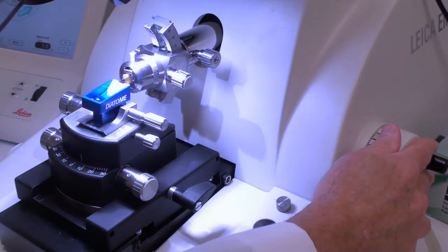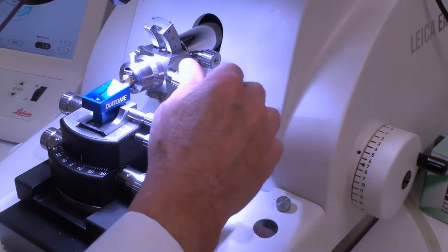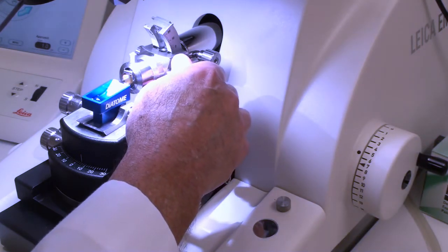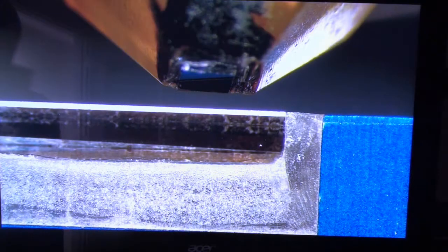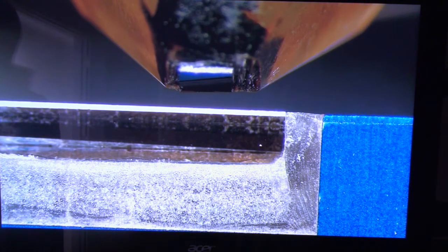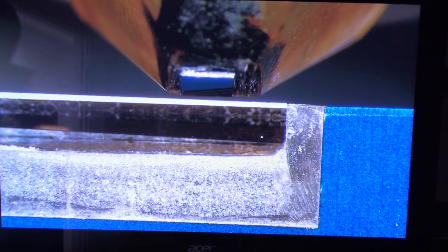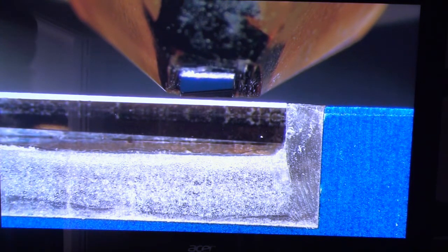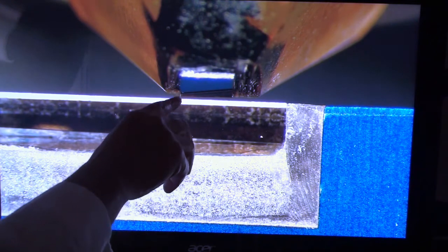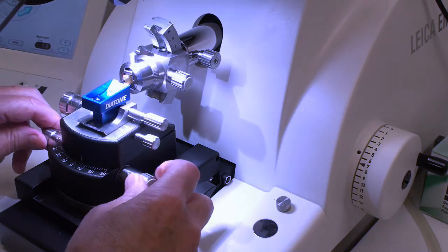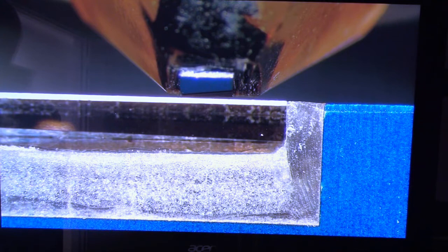We can see a little bit of a reflection and our knife edge. So the first thing I'm going to do is rotate my block so that the knife is parallel to the specimen's leading edge. And we can see that looks pretty good. As we make other adjustments we might have to change that a little bit later on. The reflection that we can just see is that diagonal line going from left to right across my block face is not straight across. It's closer on the left than it is on the right. So I'm going to change my knife arc to do that.